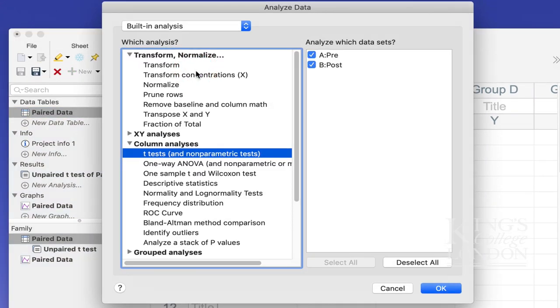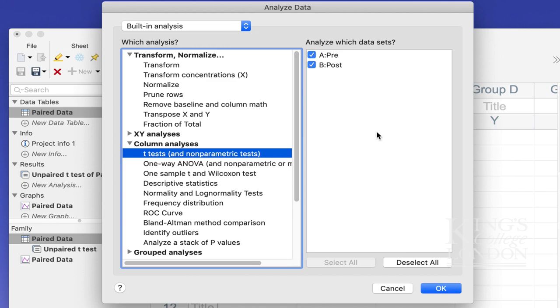This brings up our built-in analysis data window. We go down and from column analyses, we choose t-tests, and we select our two groups, group A and group B, which represent our pre and post data sets. We then click OK.